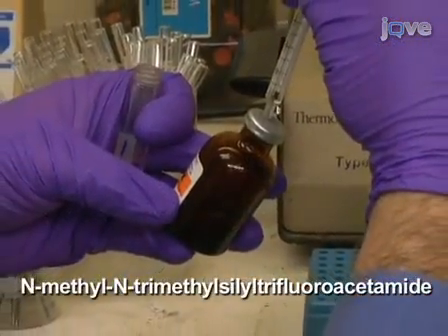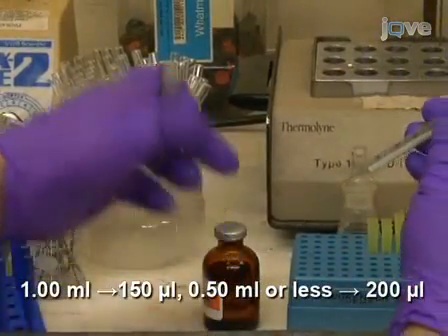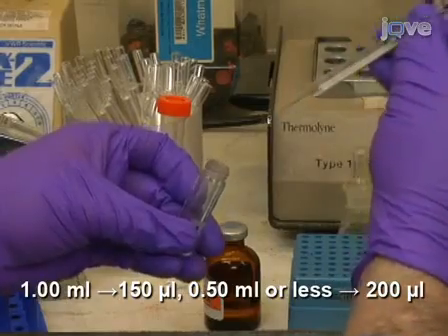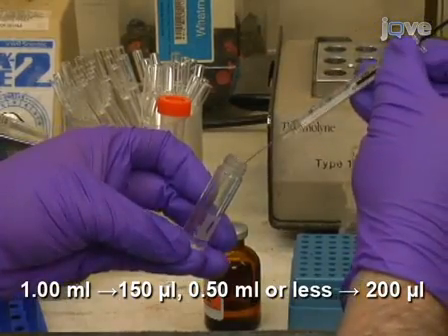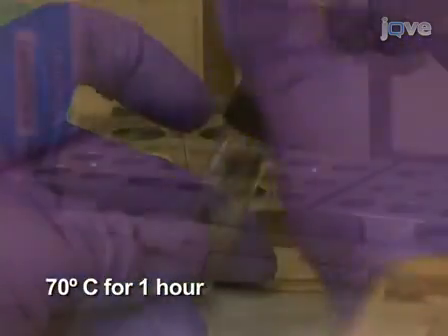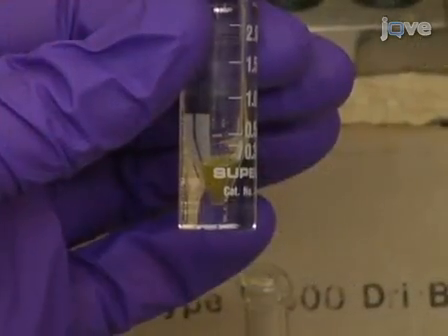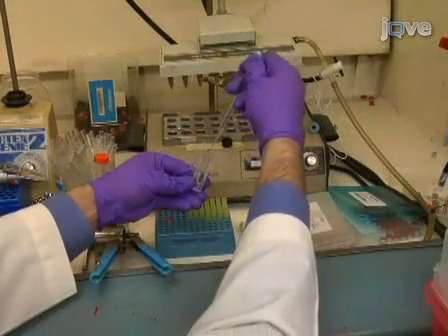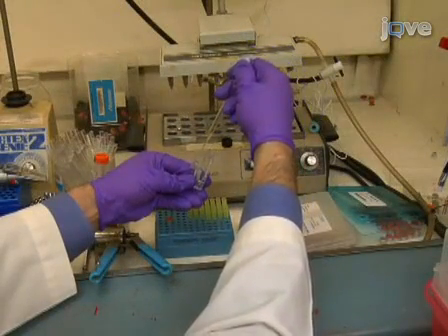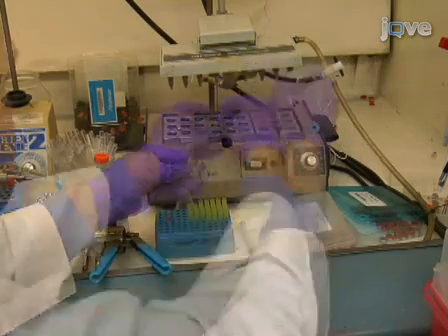Next, derivatize the sample. Add 150 microliters of MSTFA for 1 milliliter samples and 200 microliters for 0.5 milliliter or less samples. Cap under a nitrogen atmosphere and incubate at 70 degrees Celsius for 1 hour. At the end of the 1-hour incubation, work under a nitrogen atmosphere to transfer the samples to microvials for analysis on a gas chromatograph-mass spectrometer.